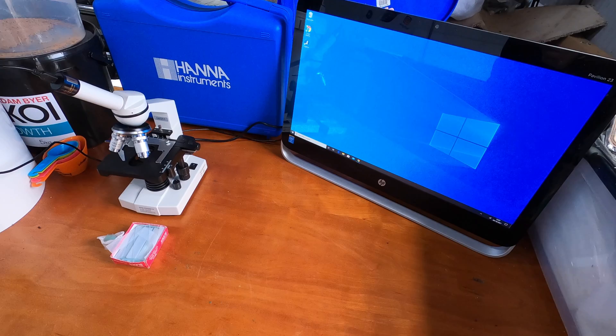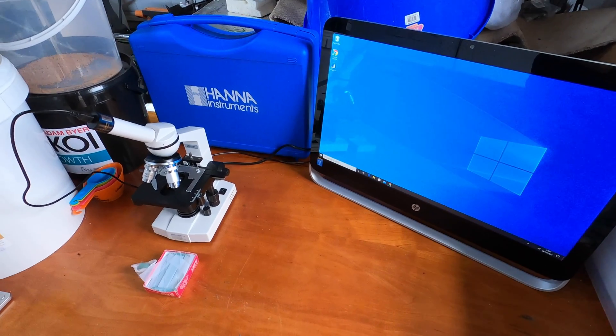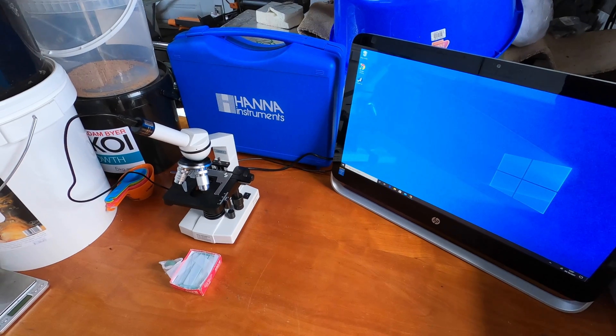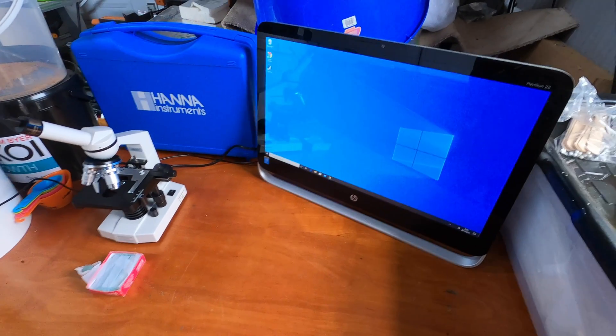I do have a video on the channel where earlier in the year I found flukes and managed to get a capture — that was done on this system. I'll stick that up there for those that haven't seen it. I put some creepy music to it just to make it even worse, but that's what it's capable of.